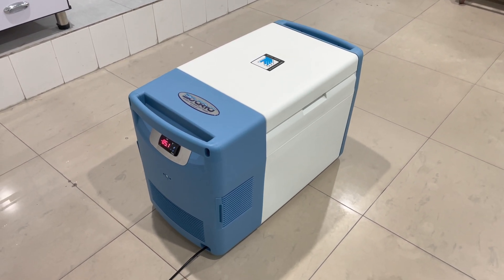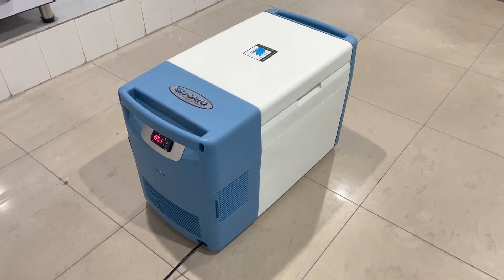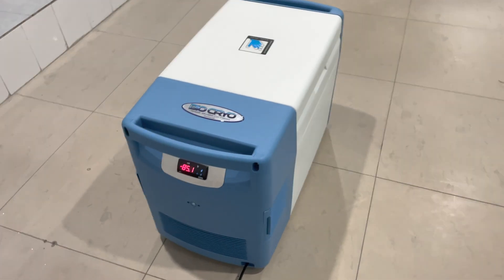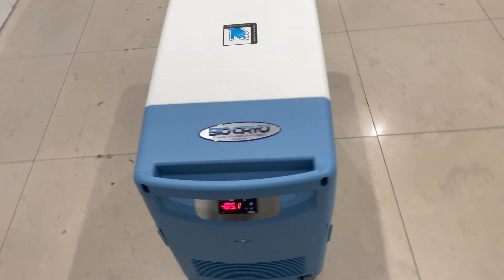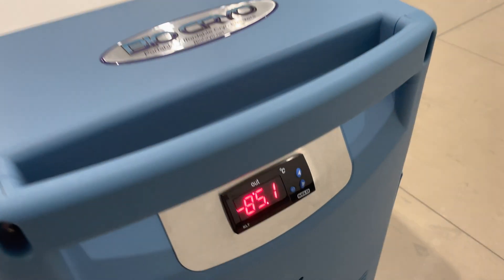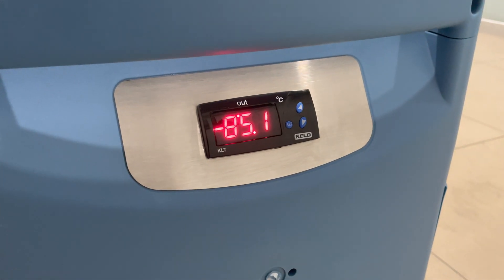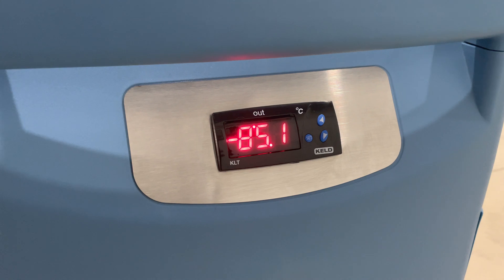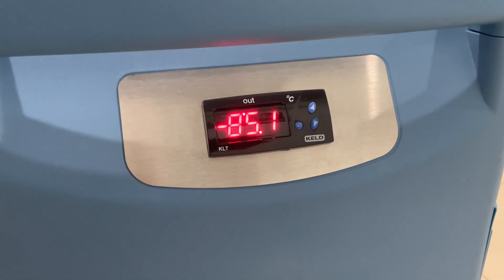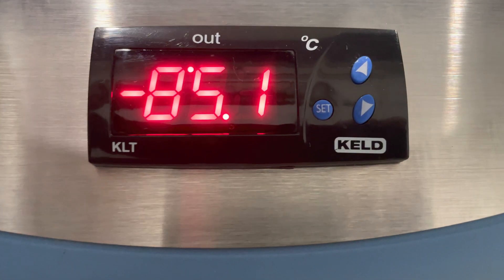I'm here discussing the Bio Cryo ultra-low temperature portable freezer. The Bio Cryo goes anywhere from negative 40 down to negative 86 degrees Celsius. I just plugged it in about 20 minutes ago and it's already down to negative 85.